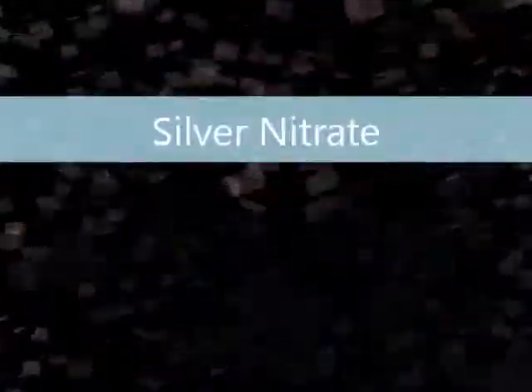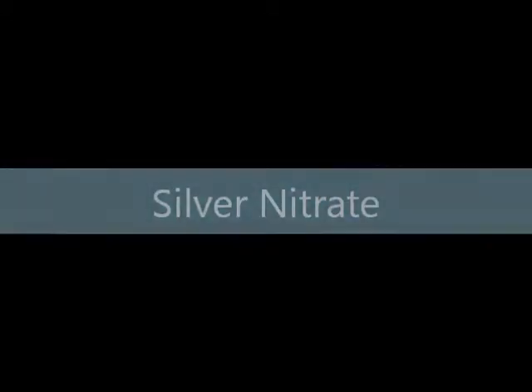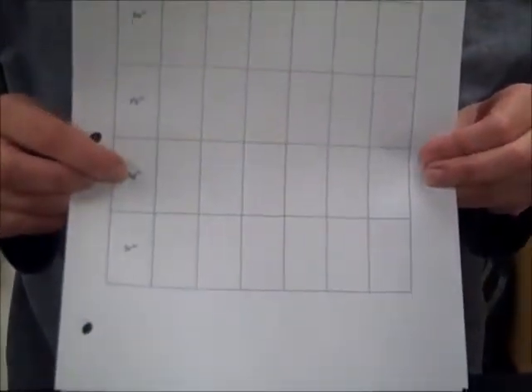Okay, and we're ready for you with row 3. All right, back for the next row. So we have the silver Ag+1 row now. This is the row we are working on. We're using the silver cation, and we're going to use the same anions we used before and see what happens.